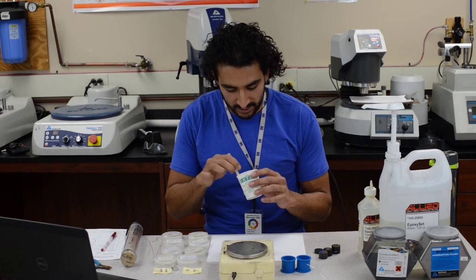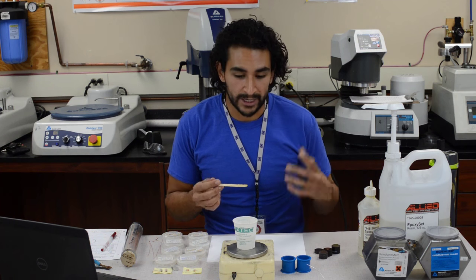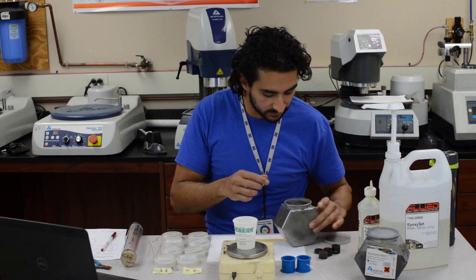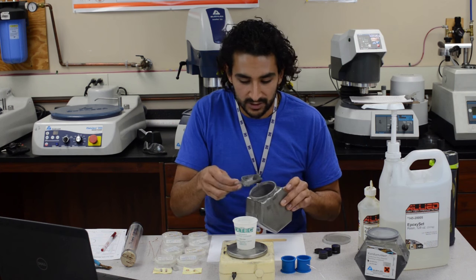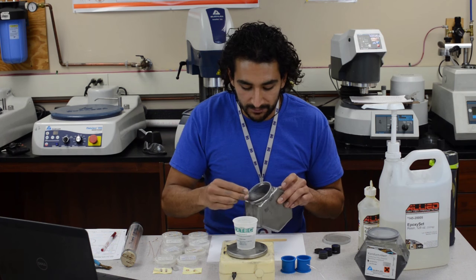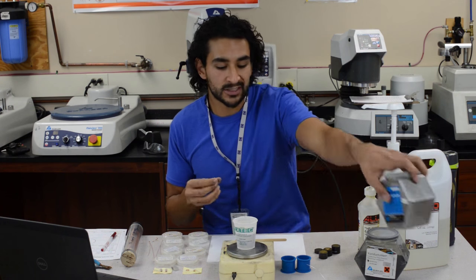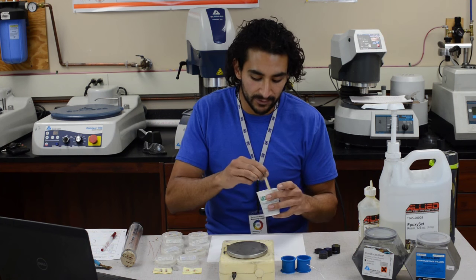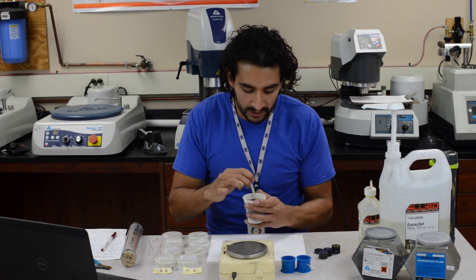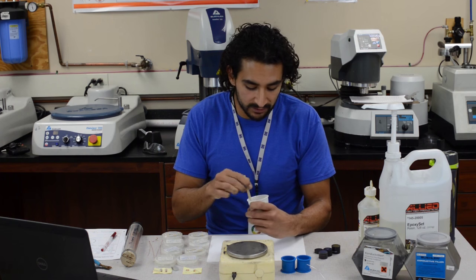Now that it's mixed, we have to add the conductive filler. I usually add about 20% conductive filler — so if I add about 50 or 60 grams of epoxy, I add maybe 20 to 30 grams of filler. It doesn't have to be exact. If you add too much it will become really thick and won't fill as well, but if you add too little you end up with a clear epoxy, which doesn't look good under the microscope. If you make it black with this conductive filler, you'll have much better contrast between your sample and the epoxy, so you want to add enough for it to be fairly dark.